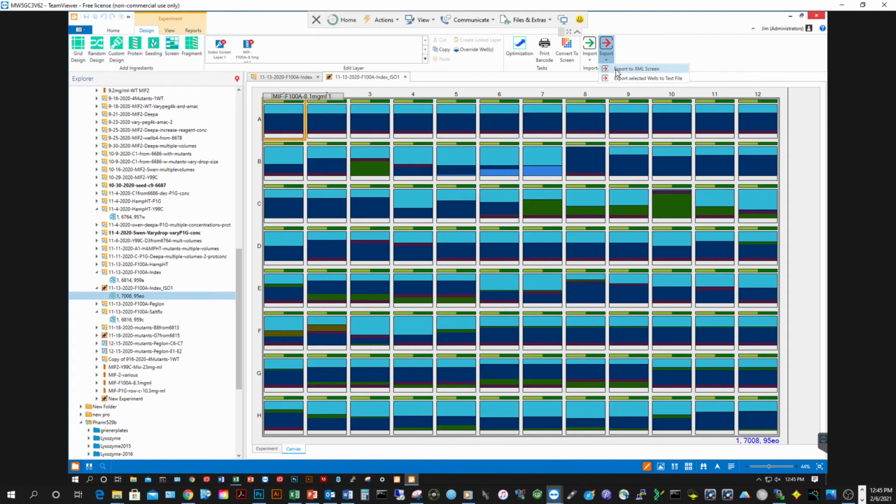So in my experience, Molecular Dimensions and Hampton will make the custom screen in a 96-well deep block for about 1.5 times the cost of a standard sparse matrix screen, and about a week turnaround. So then this process could continue. We would set the tray, incubate the tray, score it on day 5, do an optimization calculation, obtain the next screen, and so on until quality crystals are obtained.